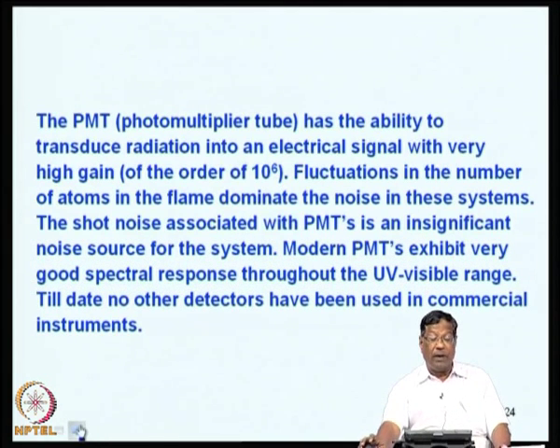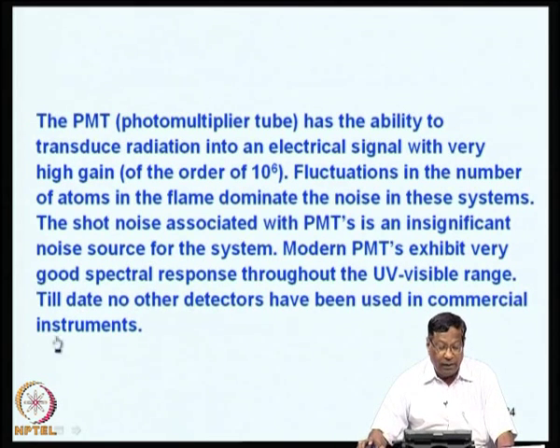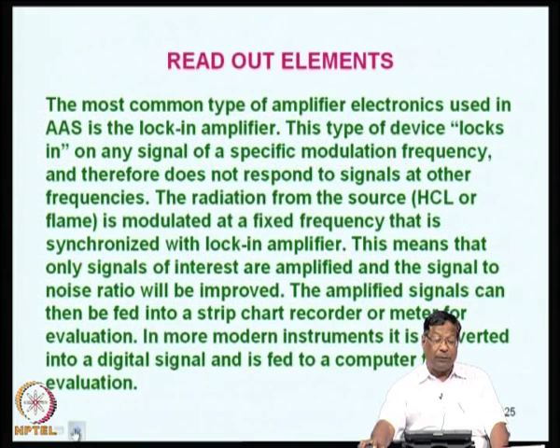The PMT has the ability to transduce radiation into an electrical signal. This and all we have covered in the last class. What I wanted you to understand is the current slide, what you are seeing I have already explained in the last class. But just for the sake of brevity, I am putting most of the words into this slide to make it clear to you.